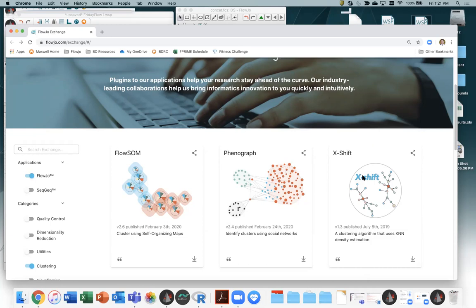points that are particularly dense that we could assume are the center of a type of phenotype. There should be parts that are particularly not so dense that maybe indicate that there are spaces between, and most especially if the distance between a group of cells is very small, so it's a very tight, compact cluster, and there are lots of neighbors within a very small proximity. So you've got lots of nearest neighbors, then that's a pretty good indicator that a population is real.